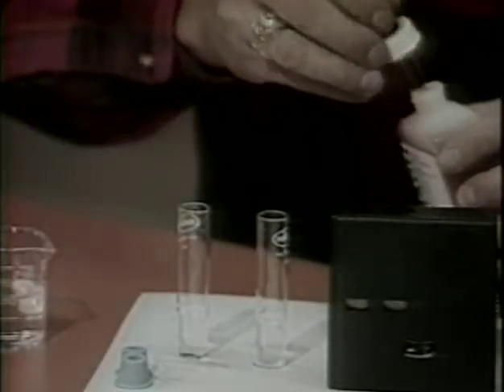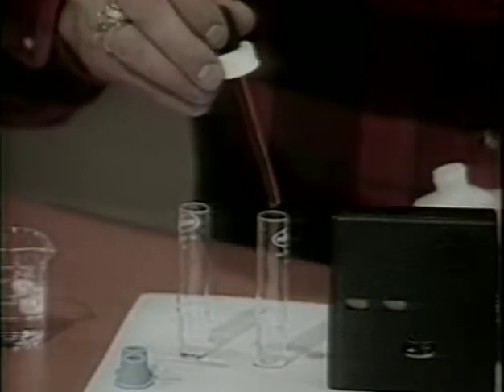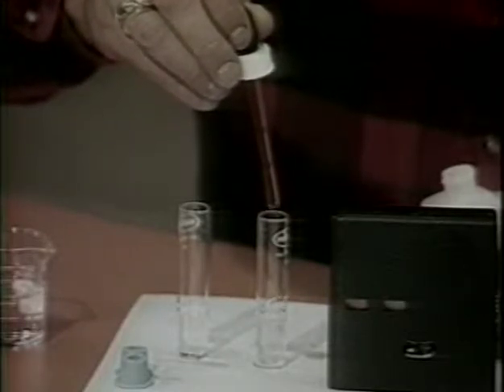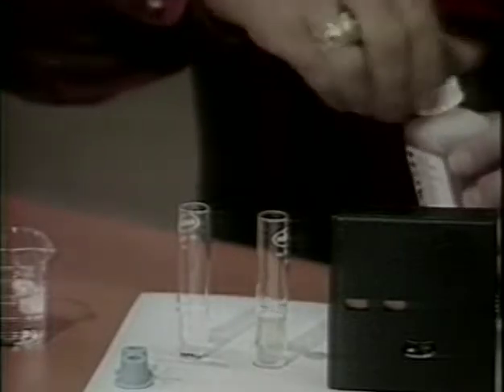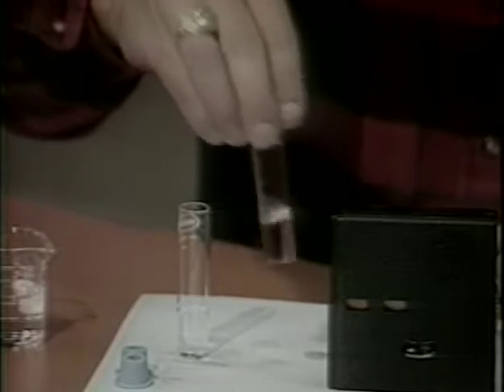Since pH, like dissolved oxygen, fluctuates diurnally, readings should be taken at dawn and at dusk to get an idea of the total variation in pH. pH should be checked regularly, but measurements usually don't have to be as frequent as those for dissolved oxygen.